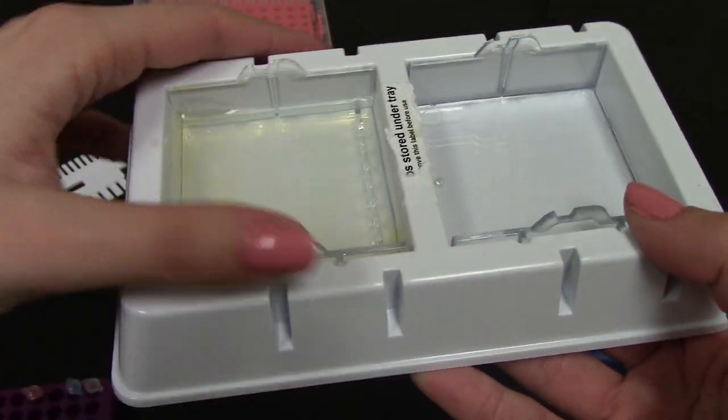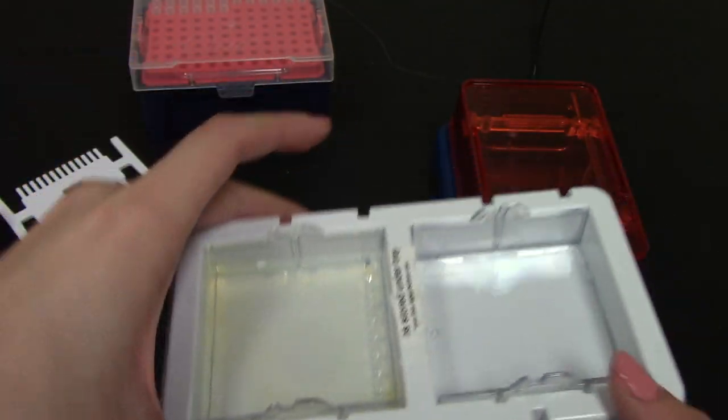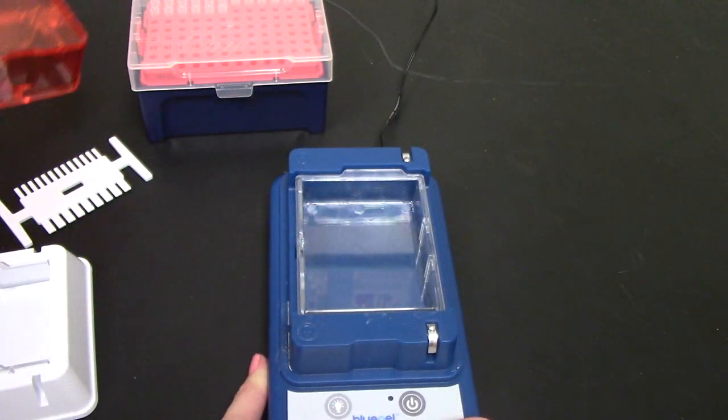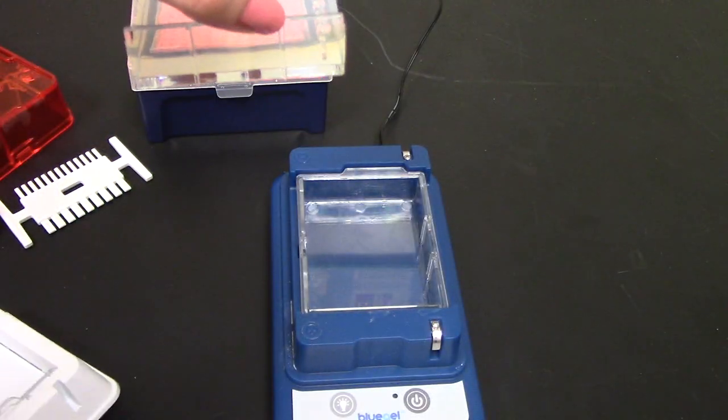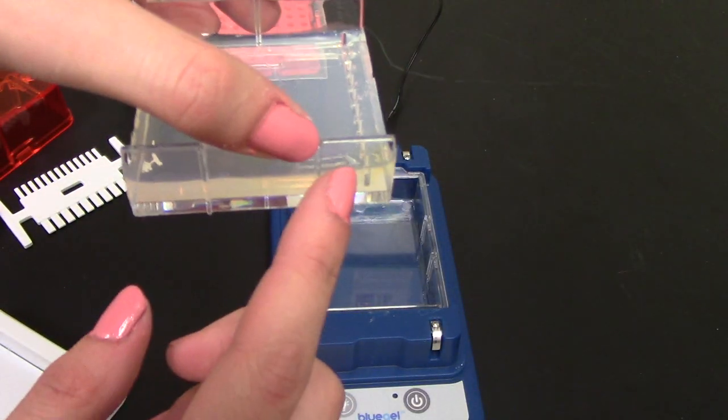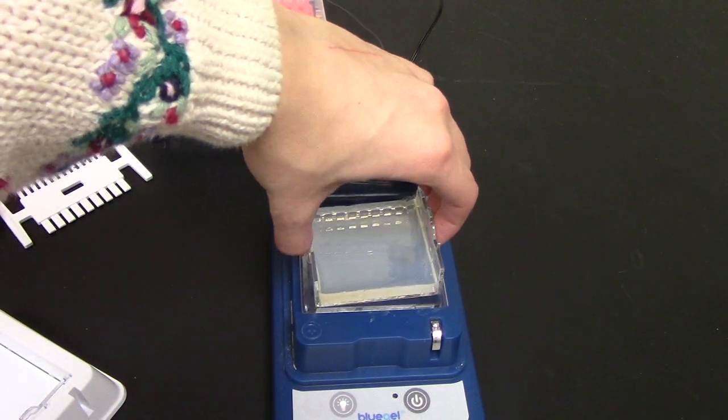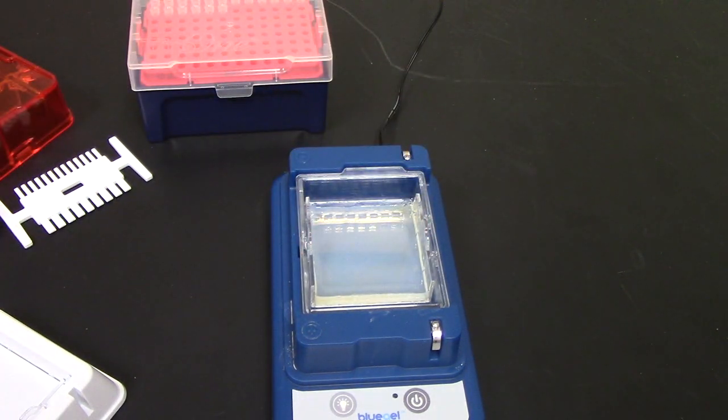I can just pick up this tray like that and I can put it into the gel electrophoresis unit. I can pick it up and then I am going to want to line up the notches—there's two here and one here—and that's going to guarantee that I run the gel the correct way.